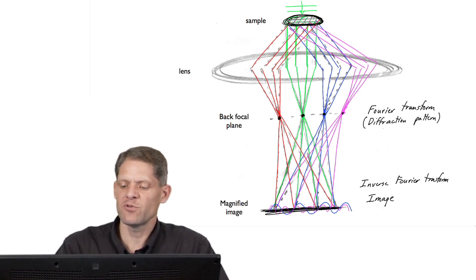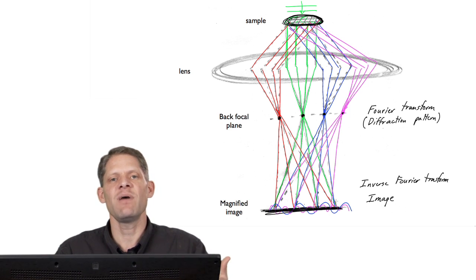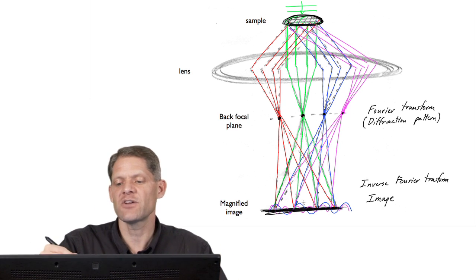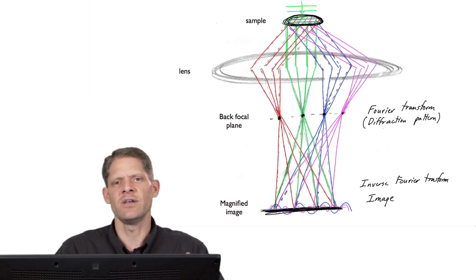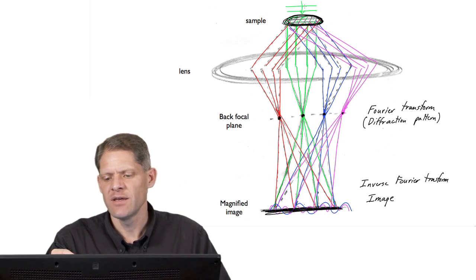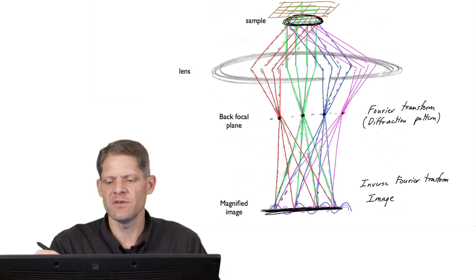However, because it's been through a lens system, as we explained earlier, this replica of the density can be much higher magnification. It can be much larger physically in space than the actual sample was. Now, how do we reconcile this with the idea that each electron is a wave? Well, if I were to draw again the electron here as a wave, and remember I tried to introduce the idea that it was a plane wave where each pixel had an amplitude and phase.